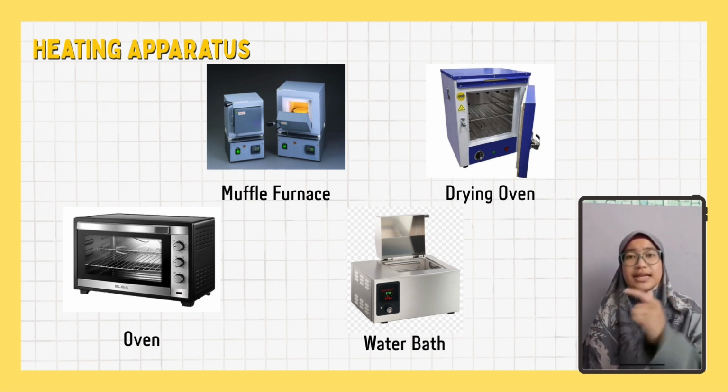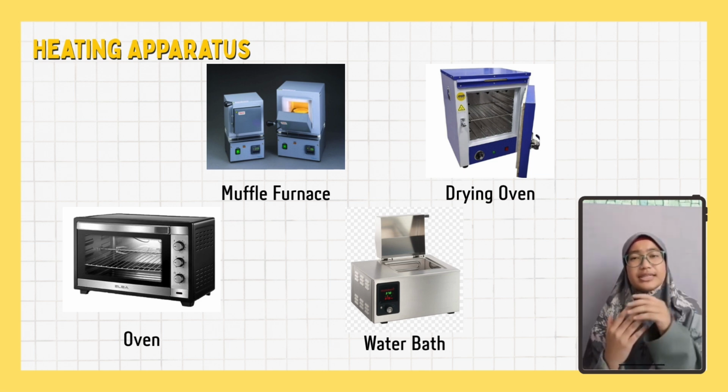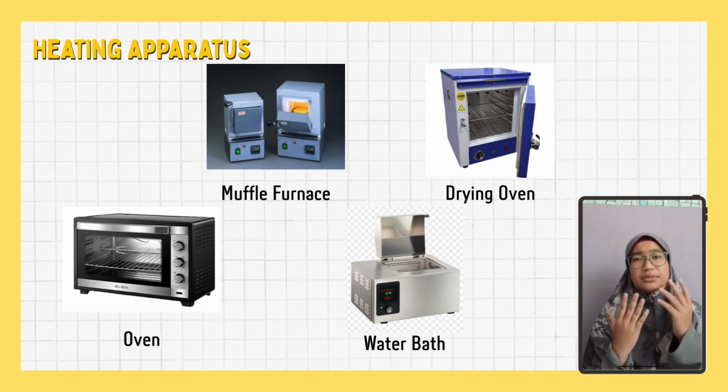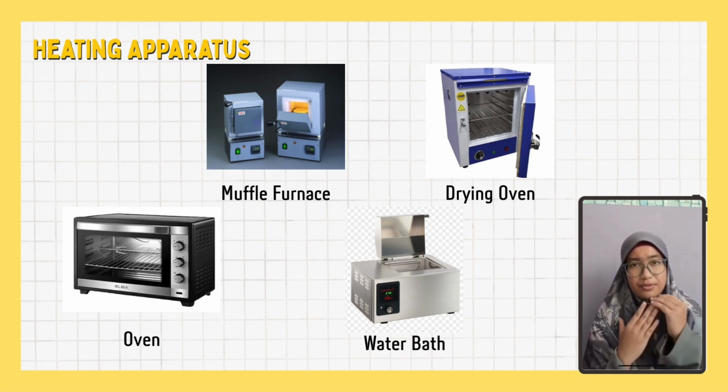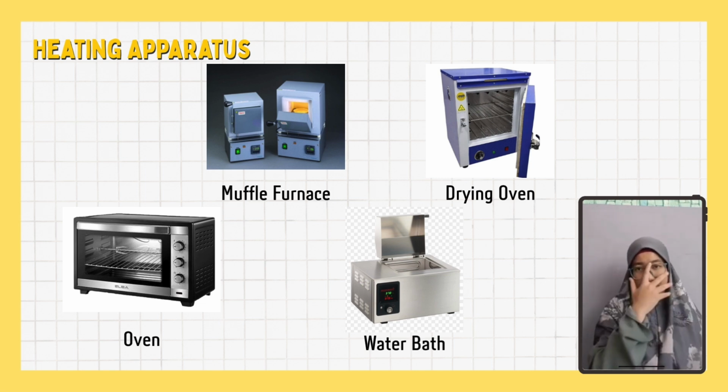For more information, the desiccator is also a laboratory tool. It is a storage device for drying samples and preventing reabsorption of moisture after oven drying. Meaning the desiccator is used to keep samples dry while they are cooling and before they are weighed, and in some cases to dry the wet sample.